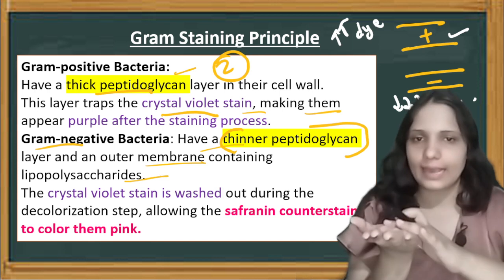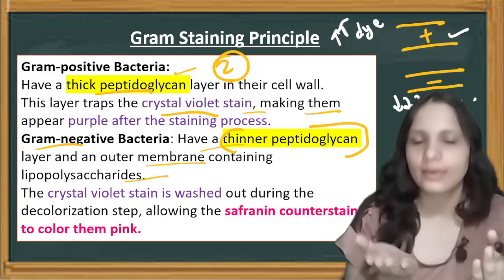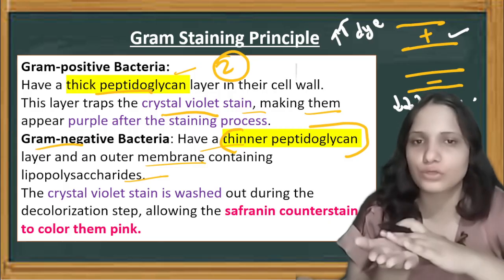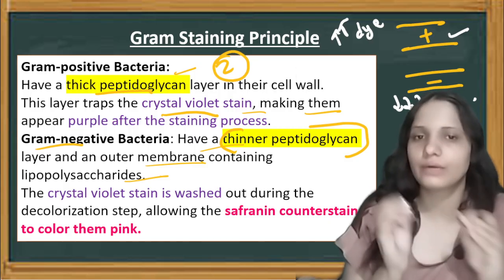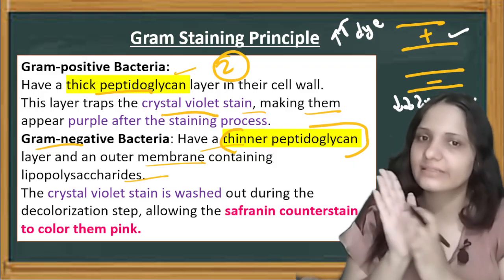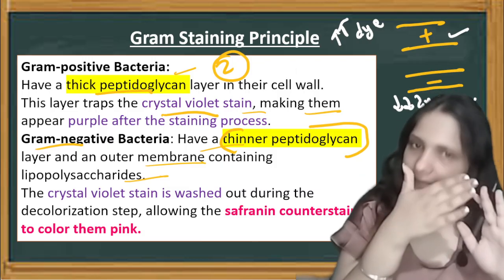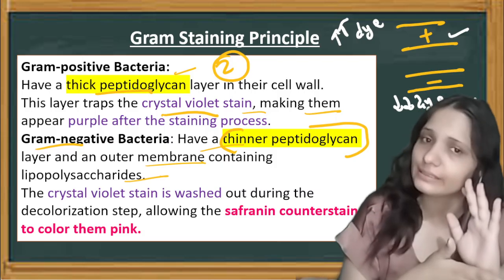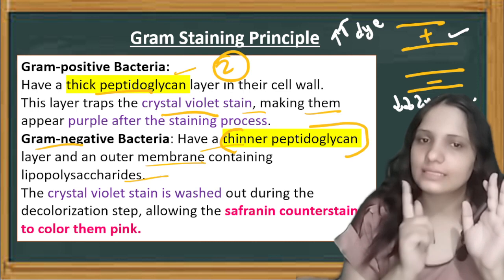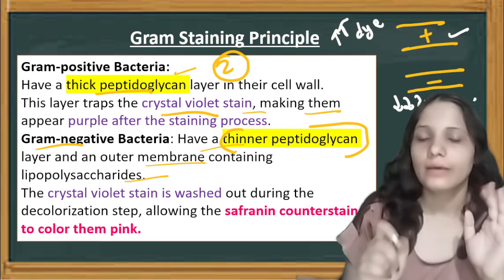See, here I have gram positive, here I have gram negative. After crystal violet, I'll apply the decolorizing agent, alcohol or acetone, which will wash these slides. Now, after washing, what will we see? In gram positive bacteria, the color remains the same. It remains purple or blue color. While in case of gram negative bacteria, this slide is completely washed, right? So now tell me, will this slide have color or not? It won't have any color, right?